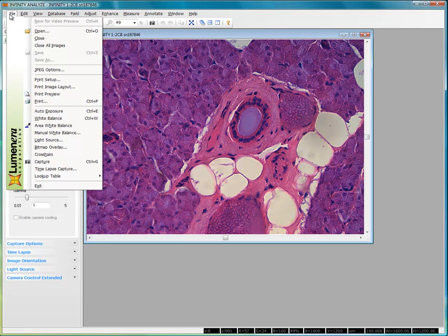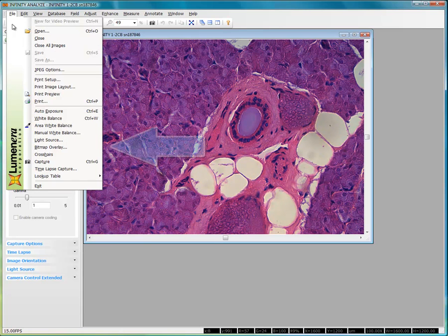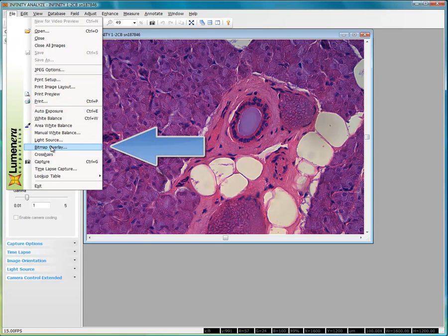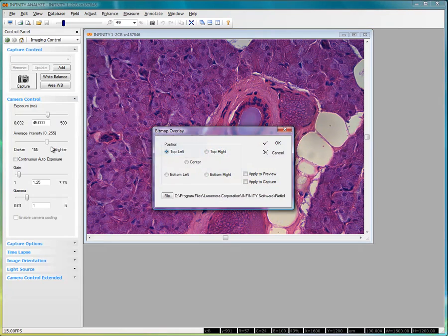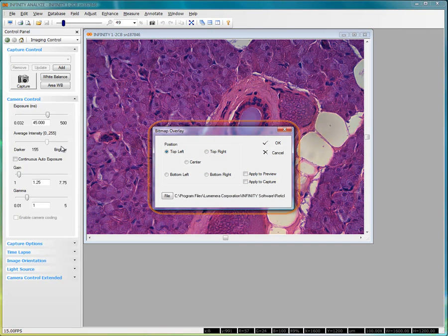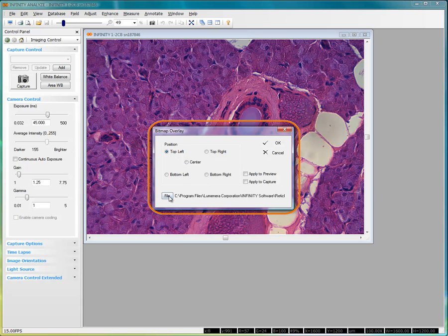We can begin with the file menu where the option to enable the bitmap overlay is located. Selecting the item from the drop-down menu results in the dialog box being presented.